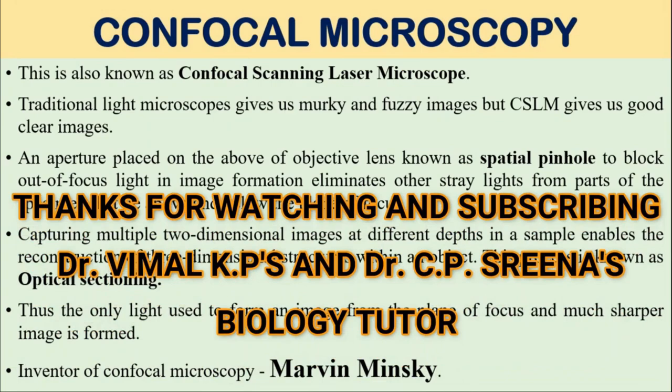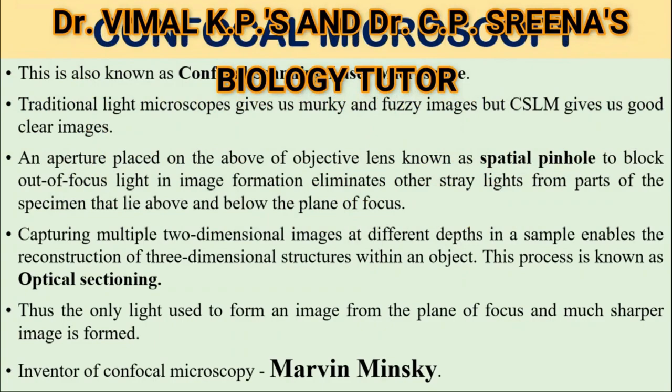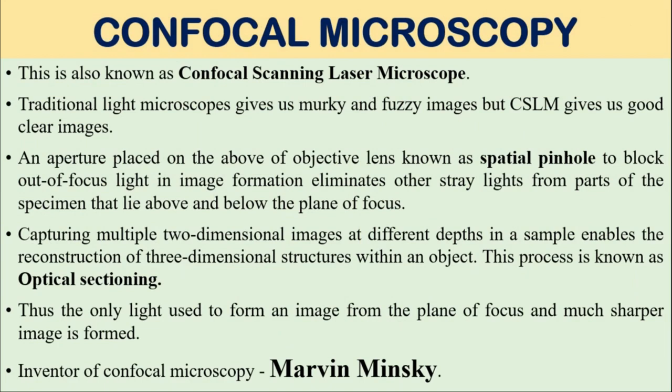Confocal microscopy is also known as confocal scanning laser microscopy. Theodor Maiman discovered the laser. What is the full form of laser? Light amplification by the stimulated emission of radiation. That is the full form of laser. Traditional light microscopes give us murky and fuzzy images, but CSLM, or confocal scanning laser microscope, gives us a good and clear image.